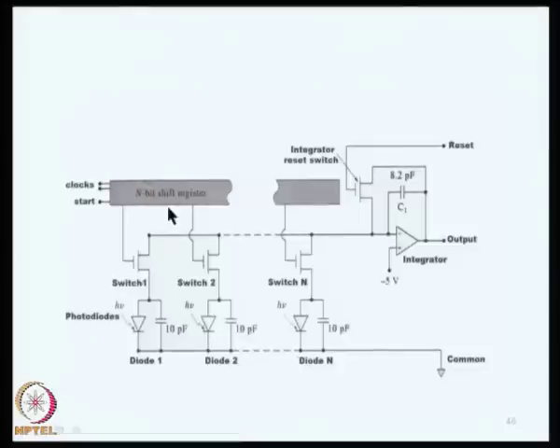electrons formed will be collected, which partially discharges the capacitor in the circuit. The capacitor charge lost in this way is replaced during the next cycle. So, it can be made to work alternately on and off, and the resulting charging current is integrated by the pre-amplifier circuit, which produces a voltage proportional to the radiant intensity. After amplification, the analog signal is converted into a digital signal and passed on to the computer.